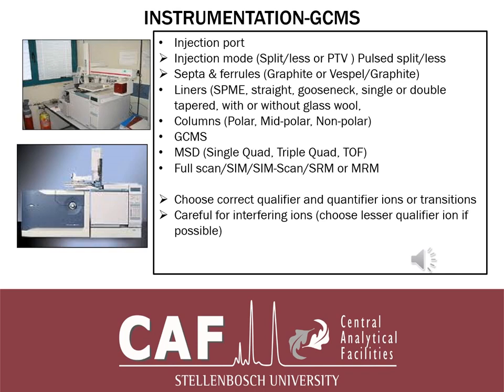Because if you only do SIM, you can't do a library search, because that's a disadvantage of that. But if you do full scan, you can do a library search. But if you do full scan, you might find that it affects your sensitivity when you do quantification, especially if you're working at lower concentration. That's why you need single ion monitoring. So it's a balancing act, in fact, to try and do both SIM and scan, because if you do SIM scan, all in all you're going to lose a little bit of sensitivity, because it's a balancing act.